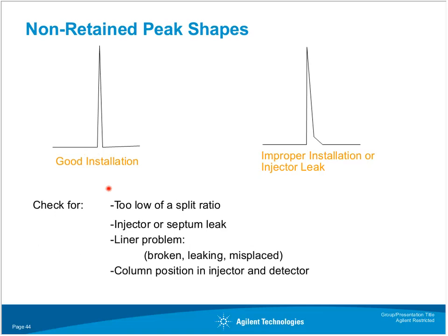And if this starts to tail, this means that your carrier gas is essentially, in a way, tailing. That means also that everything else coming onto your column is going to be tailing. So you want to make sure of this. It's just a quick, easy check. With a 30-meter column, it's about a minute and a half, 1.3 minutes or so.